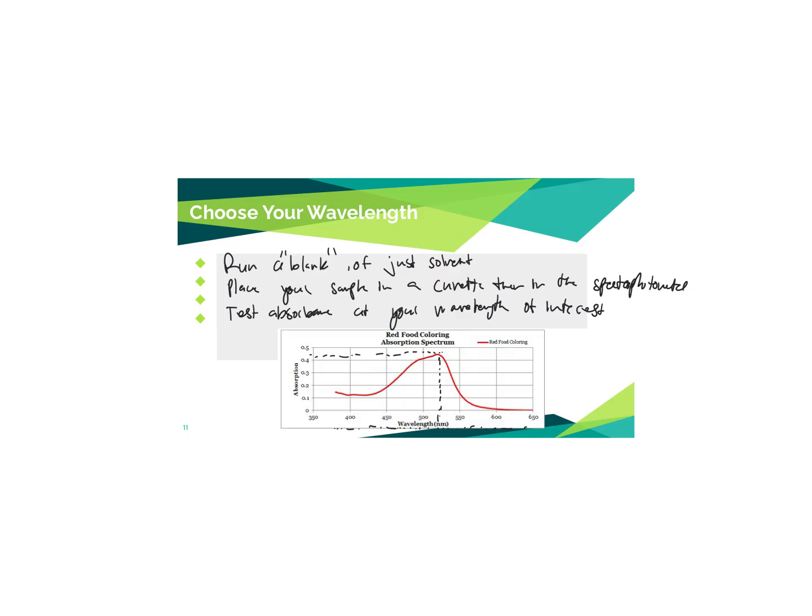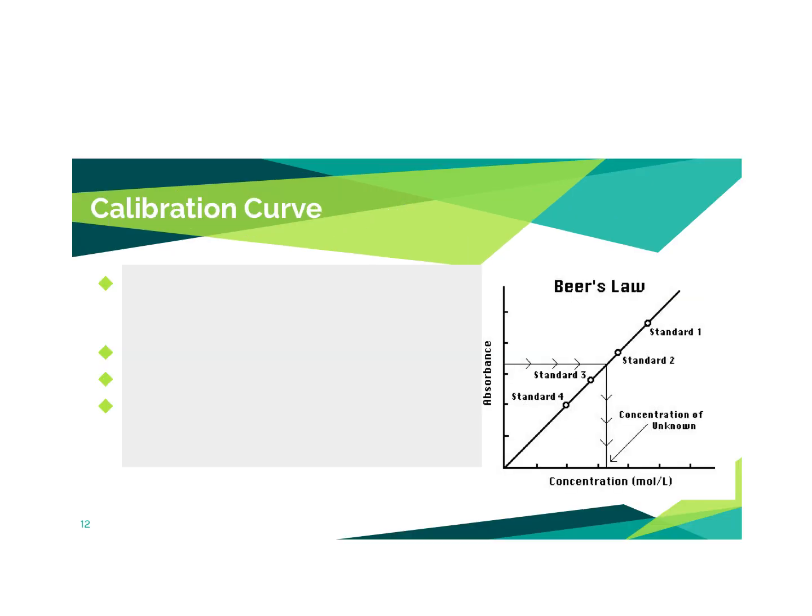And we should always use the wavelength that gives maximum absorbance. Once you've done that once, you can collect data at multiple concentrations, and then you construct a calibration curve.